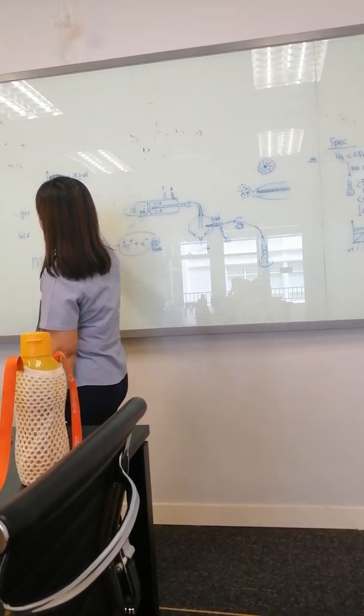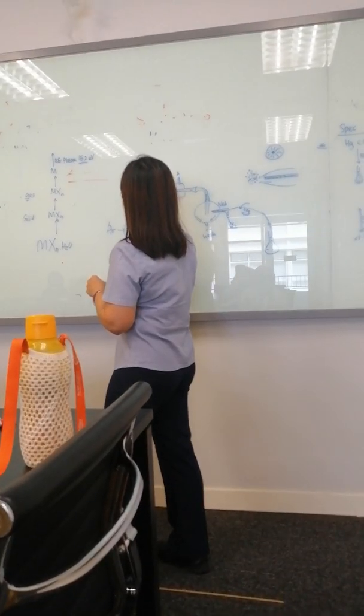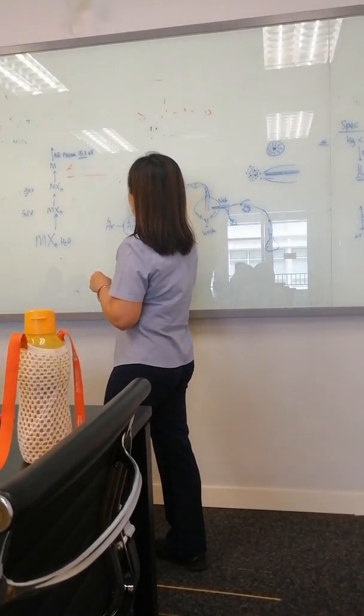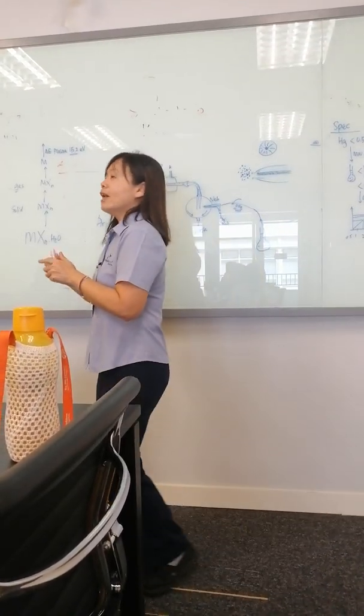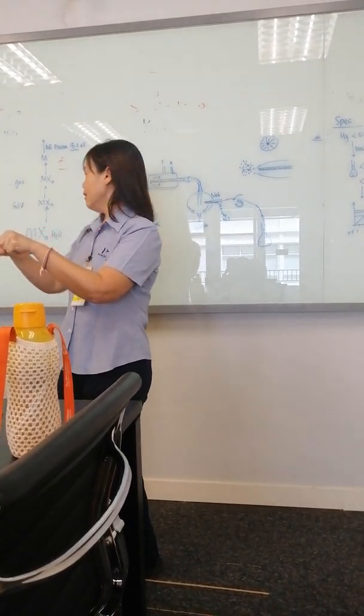Now when I draw the energy is when the sample becomes a free atom. Normally this process is like that. This is all the pre-production. So your sample has already become a free atom actually in this zone. If I draw, this is the zone where you become a free atom. Now when you become a free atom, this is the moment you're going to collide with the plasma.